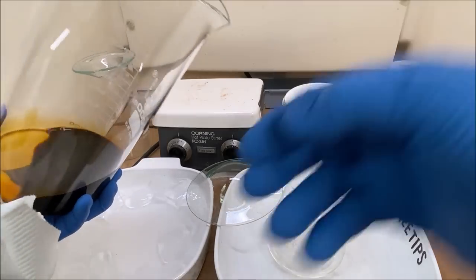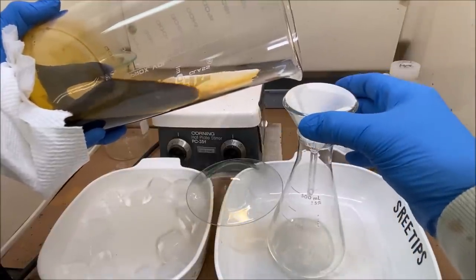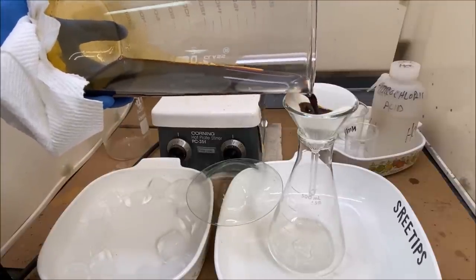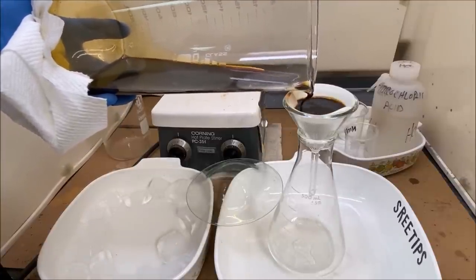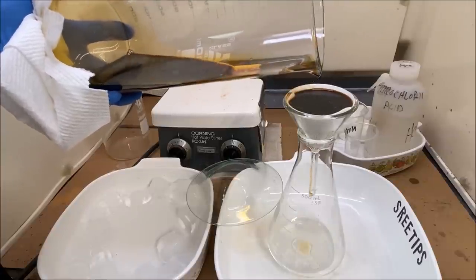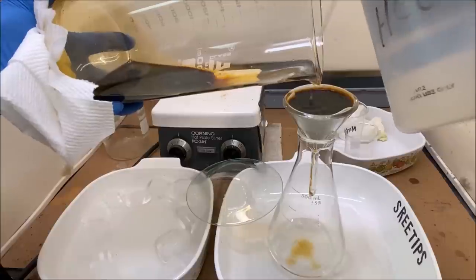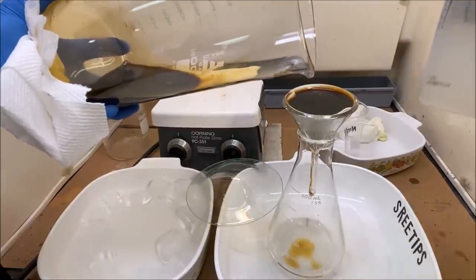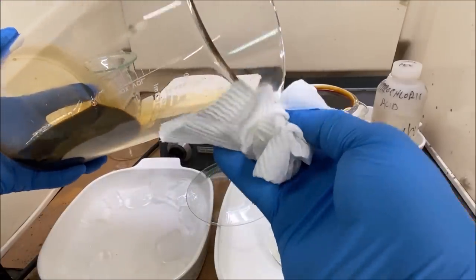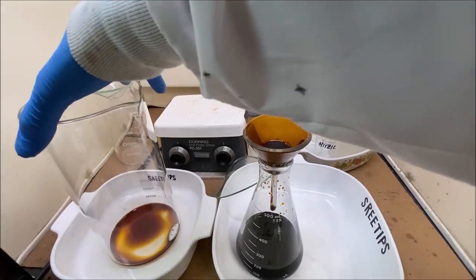We'll pour this through our filter and filter our solution. I've got a filter here that I've dampened with some hydrochloric acid. I'm just going to pour through this filter now. This might take a while. I've got just about everything pulled through the filter here.